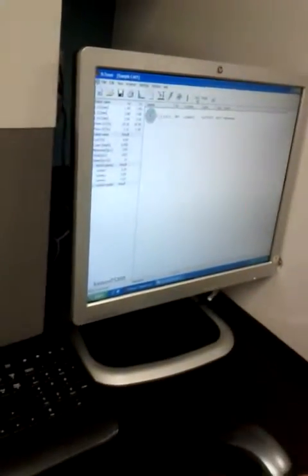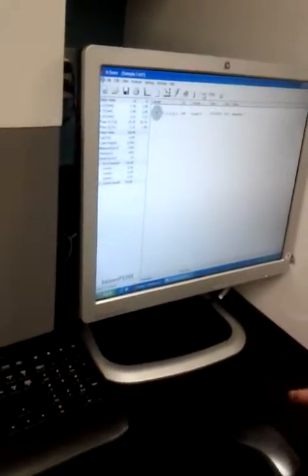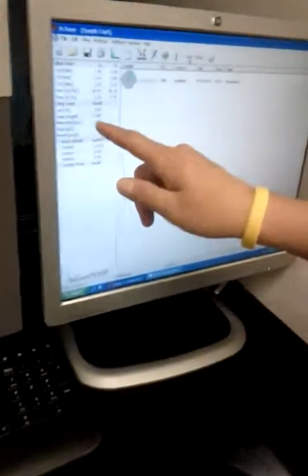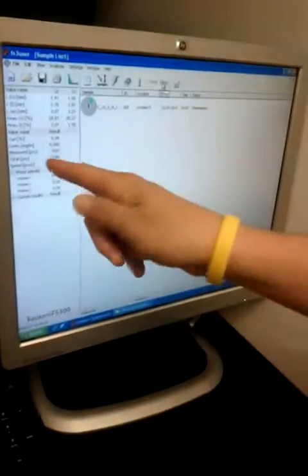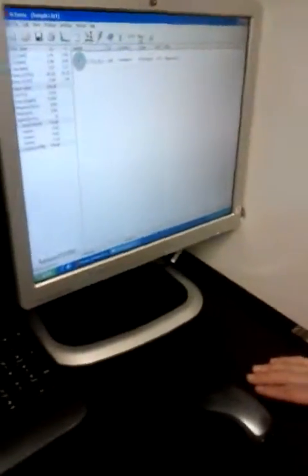You can let the equipment finish all the glass, or you can just stop. For example, if I just want 1,500 fibers or pieces measured, you come here, and once it reaches that, voila, just stop. Okay. So I'm going to bring a little to do a mixture and see. Yeah, like that.